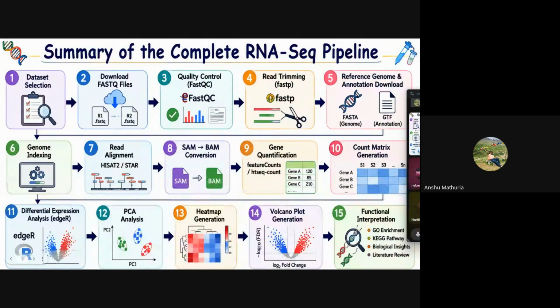There is an entire pipeline that we studied yesterday in DESeq2, where you put it in, and it is going to calculate the dispersion, the count matrix, the design matrix. Then it is going to tell how the experiment is basically formulated, and then it is going to calculate the statistical analysis test, that is p-value, log fold change, and all of that. Based on that, you are going to differentiate the genes into the upregulated genes and the downregulated genes. Using that, you plot volcano plot, PCA, heat map, and all of this plotting needs to happen.